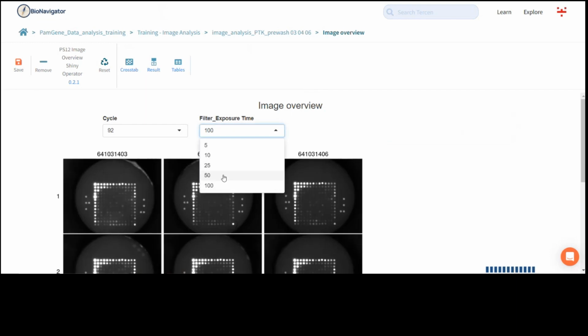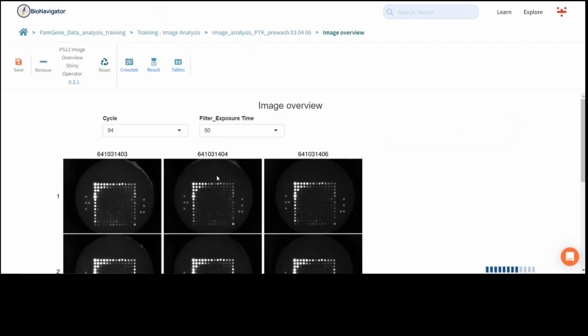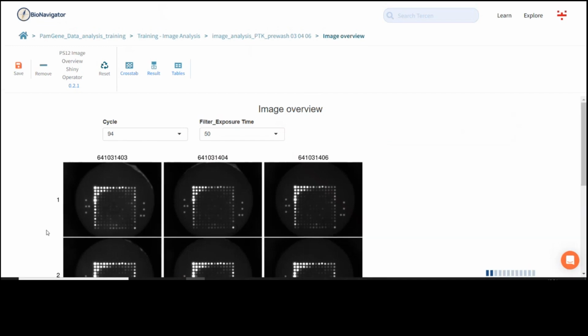This takes a lot of computation power, so if you don't do anything with it, it will just stop working. But we can reset it and run it again. If everything is all right, then we are done with this step. But if you would like to document this and have a lab journal or similar, you can take a screenshot and put it there.